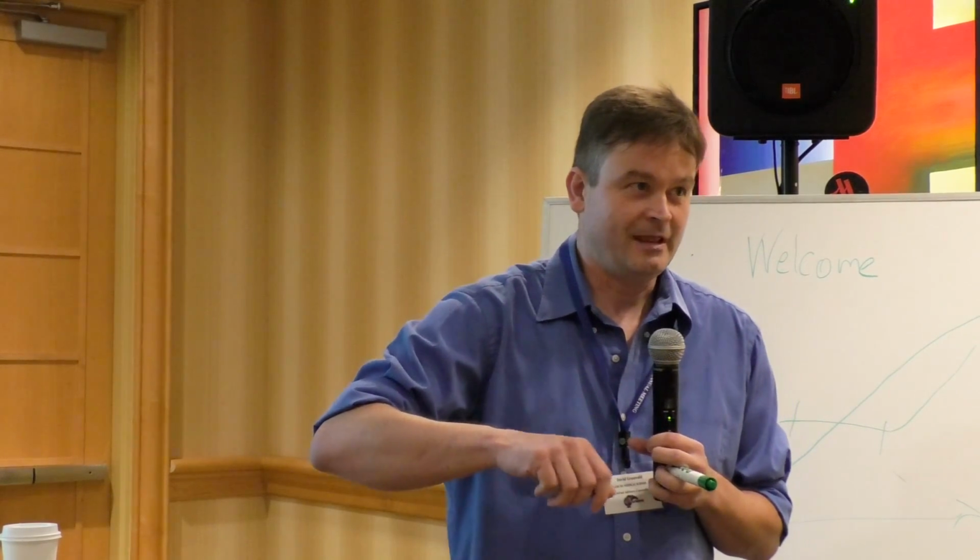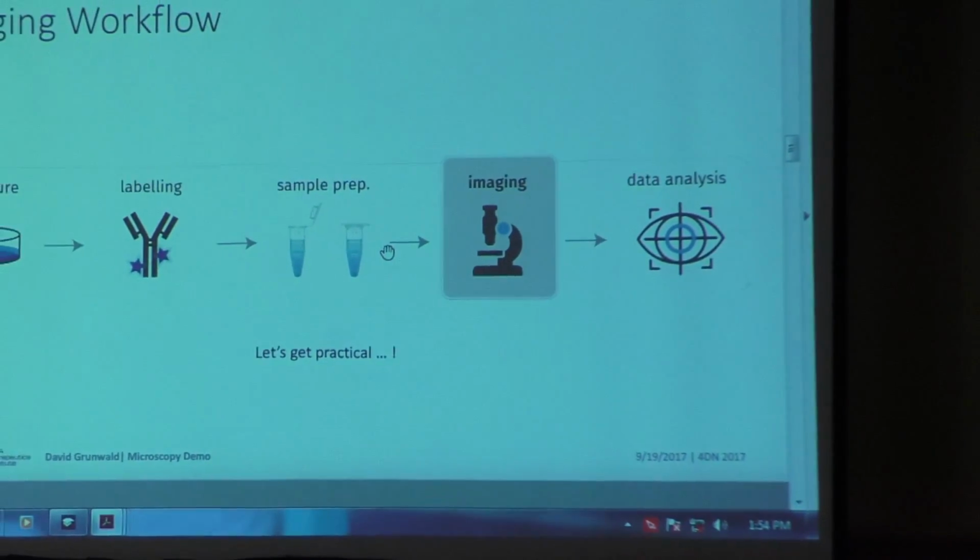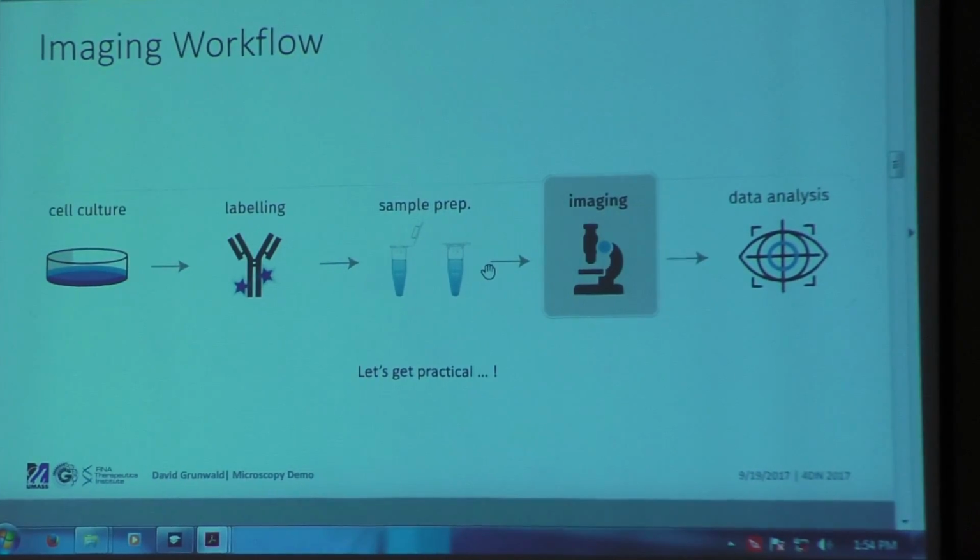Then the 4Pi microscopes hit the market. Now, the lab where I was hosted during my PhD, they got one of those. Undergrad students spent the whole summer measuring thicknesses of cover glasses. And not of the cheap ones, the good ones. Just because it's an interference method, 20 nanometers thickness difference make a hell of a difference. Yeah? Okay, so we looked at lots of parts of variance, but that is still a machine.